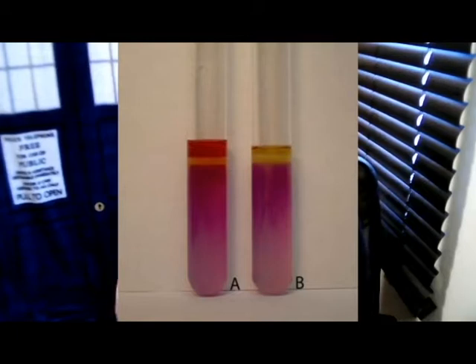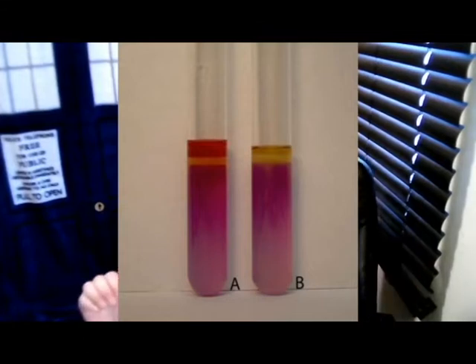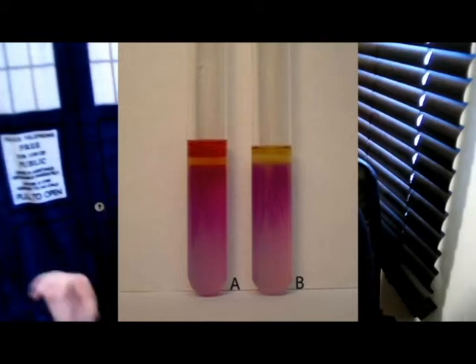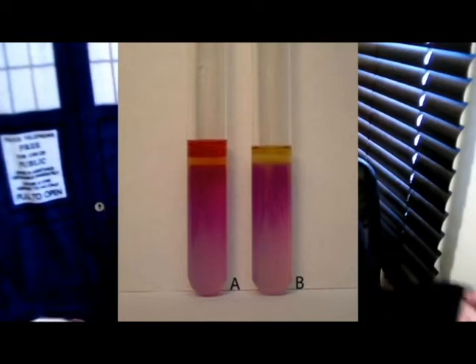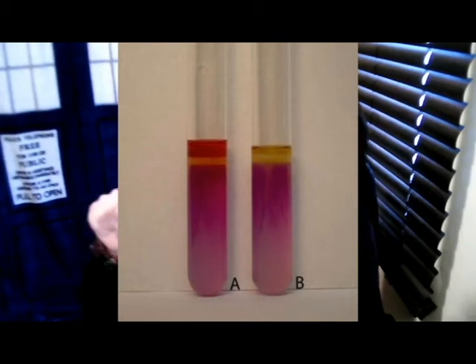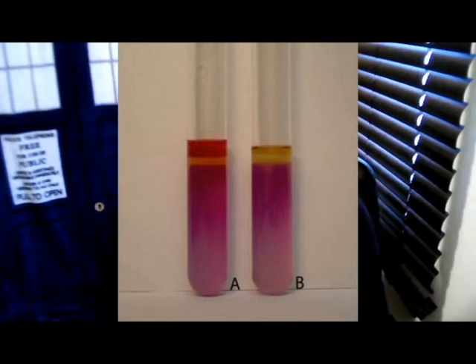3 things that it tests for, and that's fair game on the exam for Catherine to ask you a multiple choice question, asking like, what does MIO test for? And the first couple answers will just have 2 of the 3 in each one of them, and the third answer will be, let's say, all 3 of those tests. So remember that the MIO tests for ornithine decarboxylation, and that's shown by the gray haziness at the bottom. It tests for indole, which is reached by the Kovacs reagent at the top of the tube, and then the motility, which is the haziness within the tube.